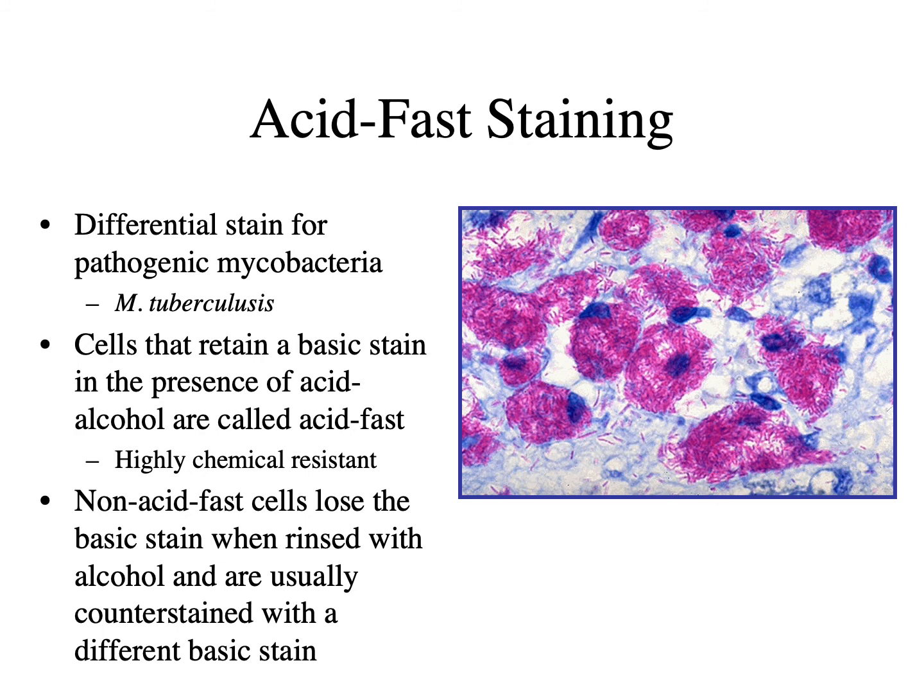Acid-fast staining is really for clinical significance, and that's important. Acid-fast refers to a certain type of bacteria that are in the family Mycobacteria, and that includes tuberculosis. There's a few other things in that family in addition to that, but tuberculosis is so important. We actually think there's about 2 billion people on this planet that are infected with tuberculosis bacteria. It's in a latent form, but it's one of the really significant diseases on planet Earth for people. So acid-fast staining basically helps us identify tuberculosis.